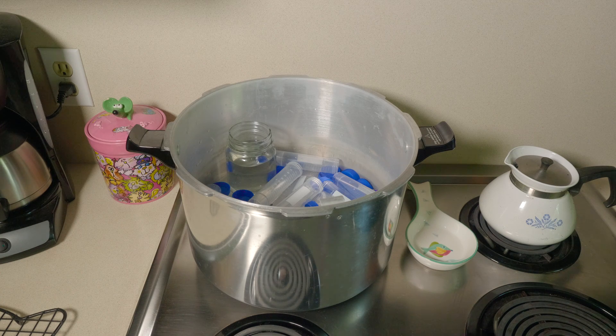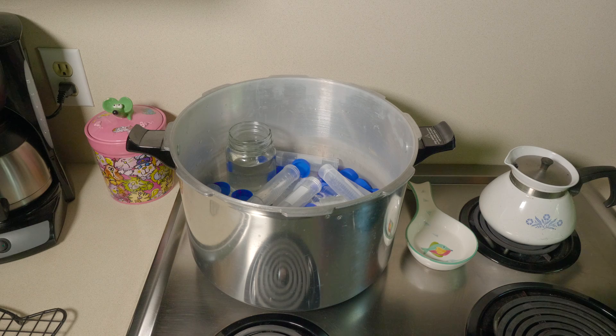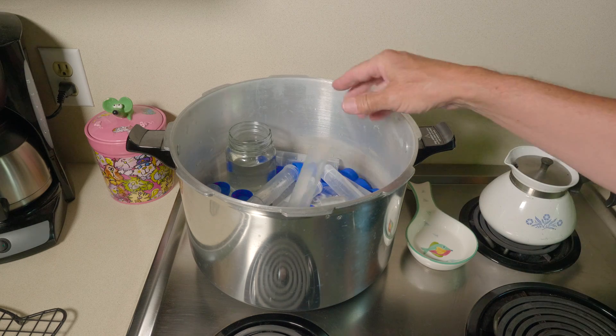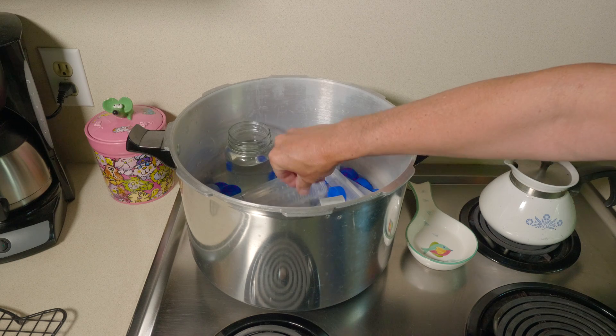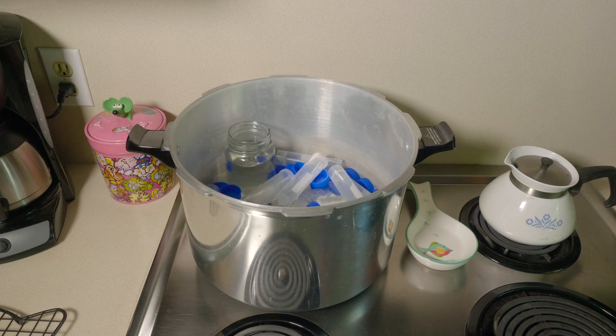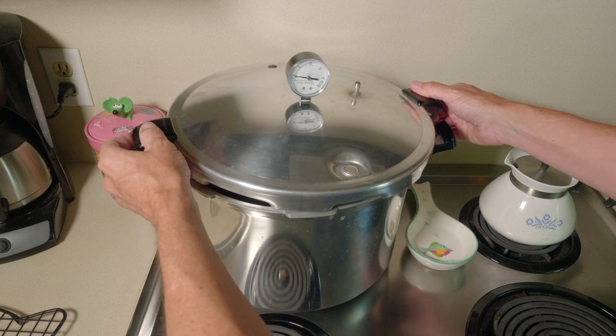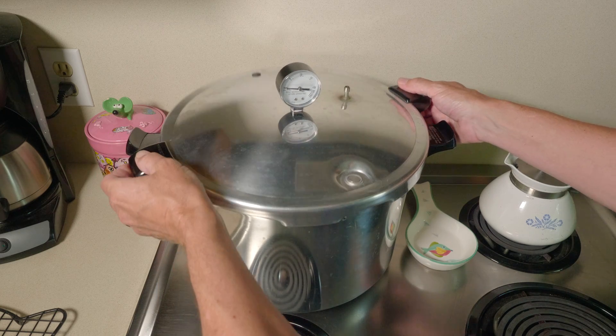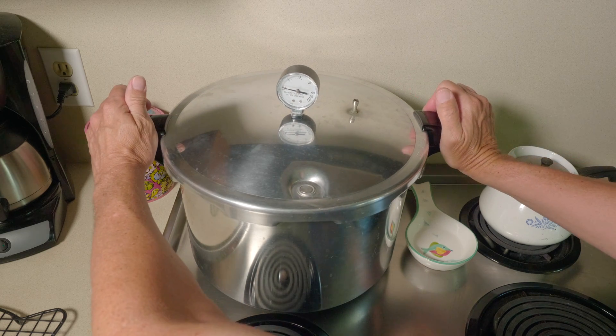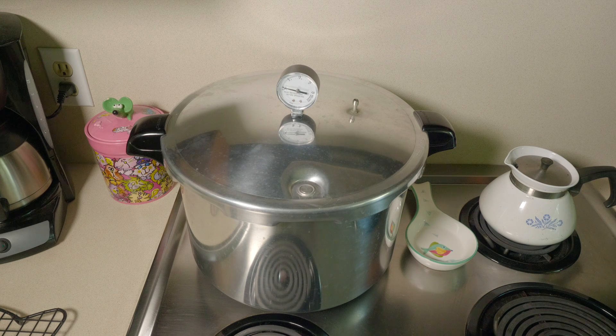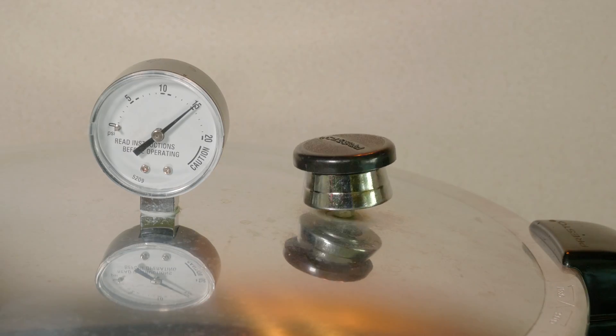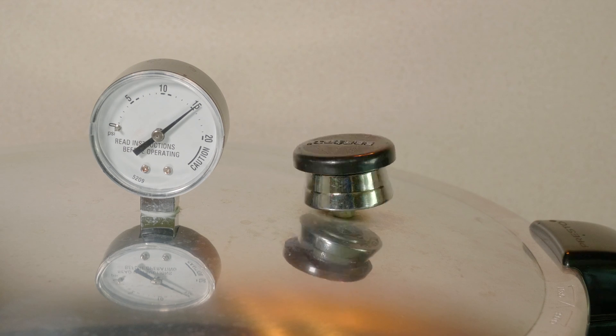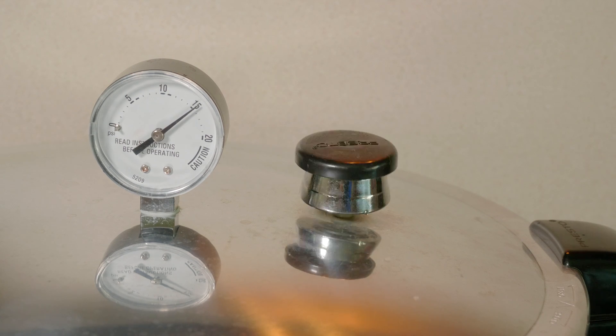I like to start with the pressure cooker. Throw all my vials in, any kind of mason jars or anything I'll be using to transfer the wort around. Set it up there with some water, put the lid on. I just run it up to 15 psi, let it go for five minutes or so, just to get everything nice and clean.